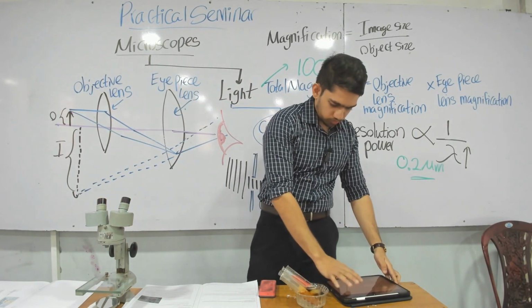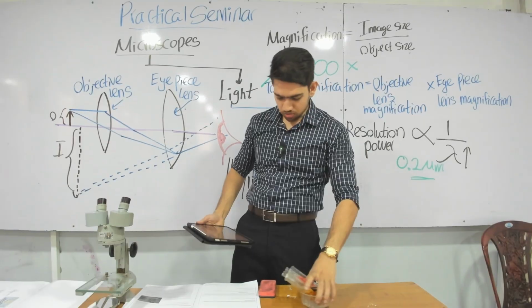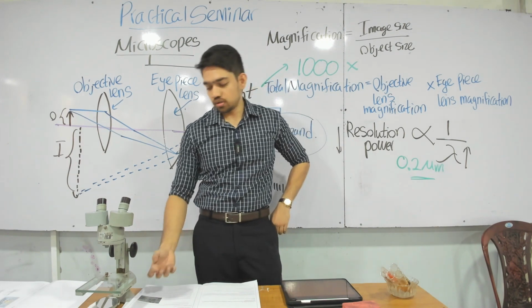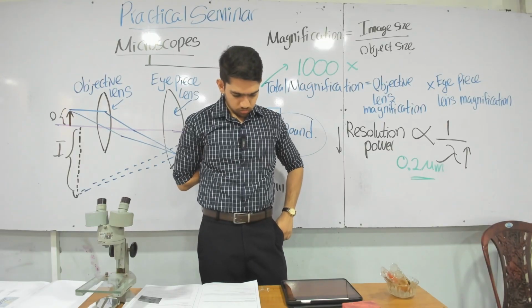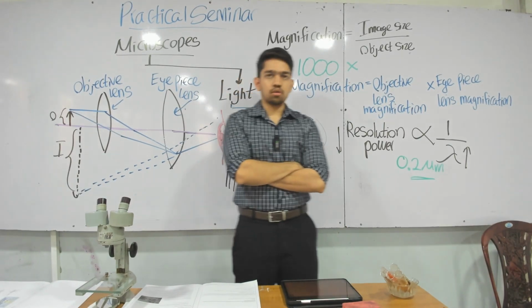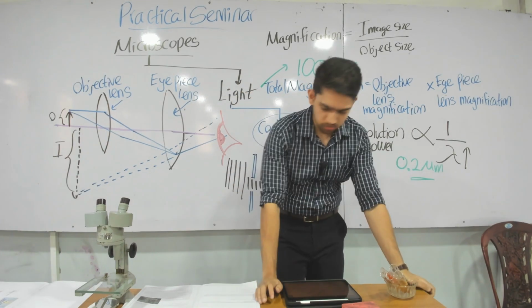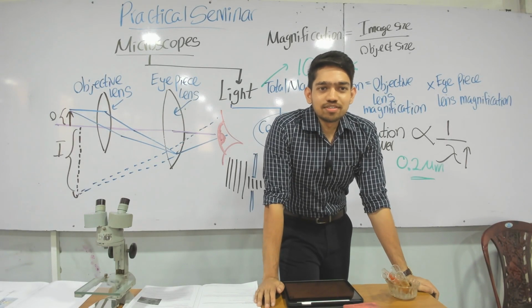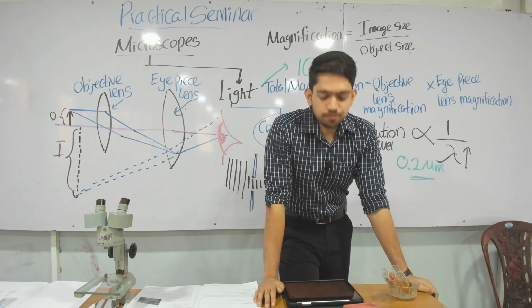Okay. Come to parts of the microscope. Now the first one is the main switch, right? So that is talking about a light sort of electric microscope, so the light source is electronic. Right down in the front is the main switch. It's near simple: the main switch turns the light source on and off.